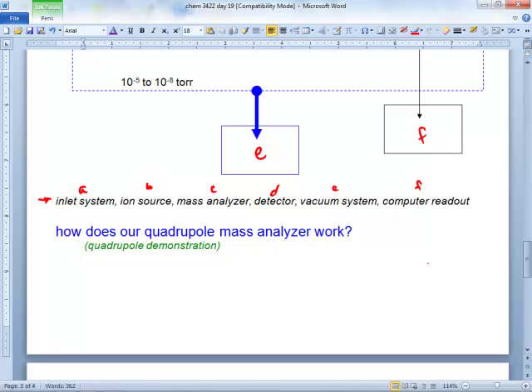Now what's going on over here? Okay, but you have a mixture going on right here. So what piece of equipment are you going to be? Oh, the inlet. Okay, she's the inlet. So you're going to inject everything into her. Now, when you say inlet, are you talking about the GC or the inlet system? Inlet system.